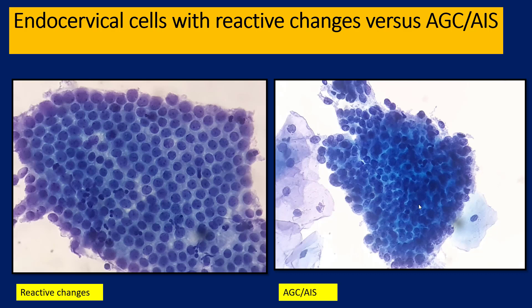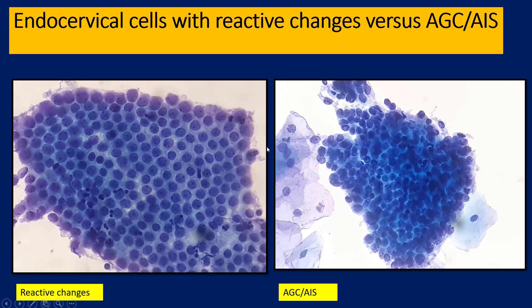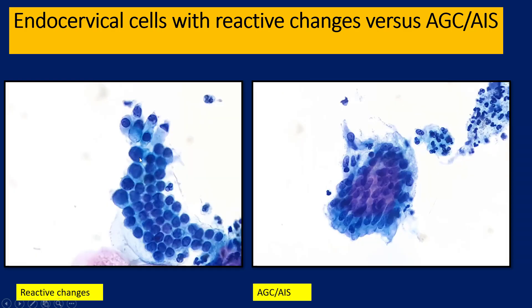Over here, even with this degree of anisonucleosis, the cells are still arranged in a pretty much monolayered kind of sheet with minimum overlap and not much derangement of polarity — so this is reactive change. Over here, the nuclei have become elongated, there is a degree of overlap, and a kind of pseudostratification pattern — so even with this degree of anisonucleosis, it is not reactive. I'm going to call it AGC, AIS, or the like. This is abnormal.